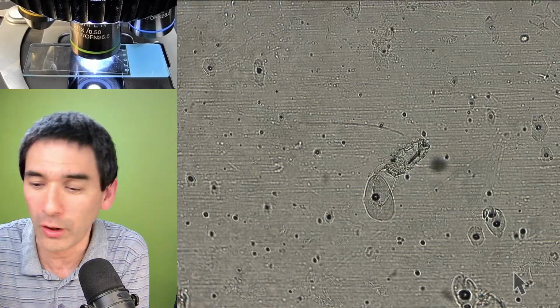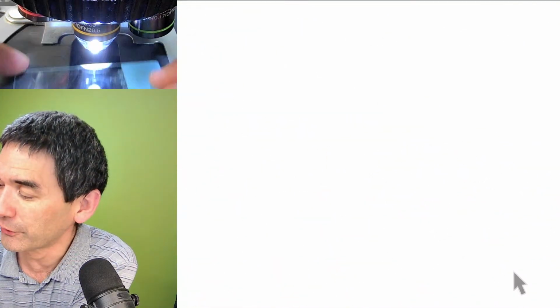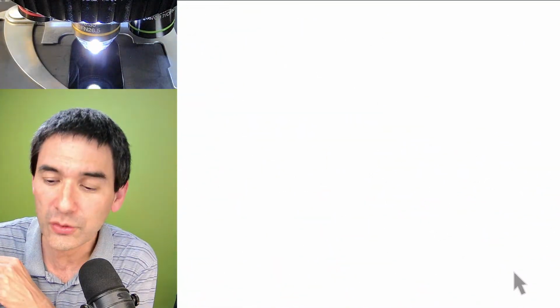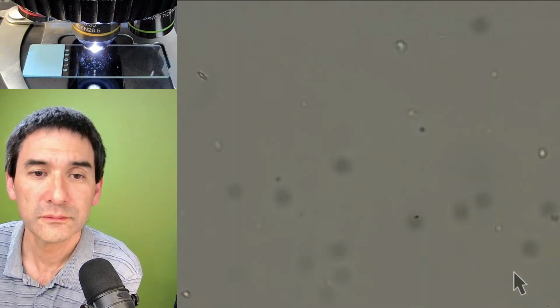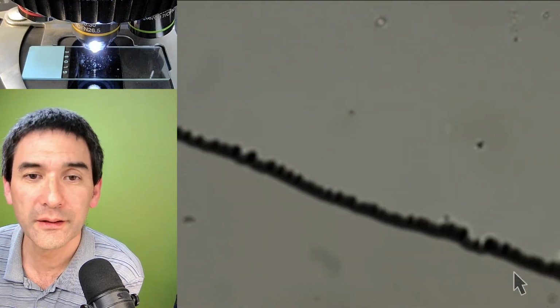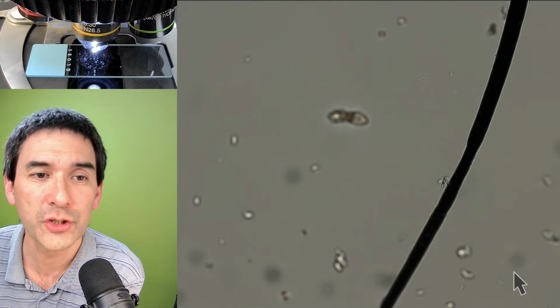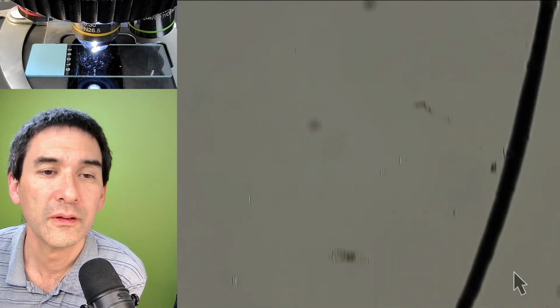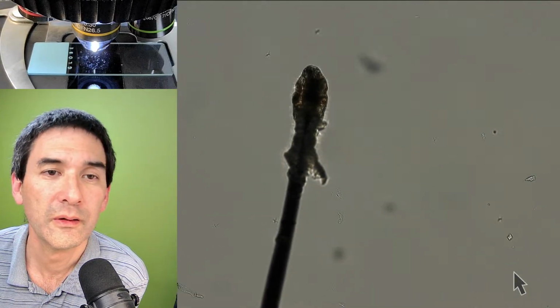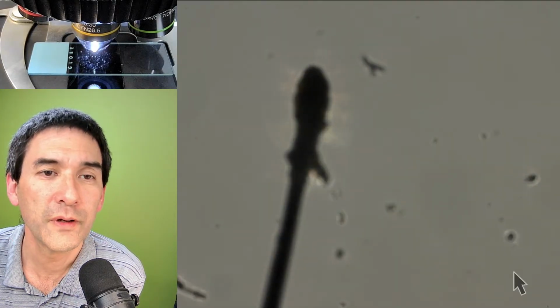Then I would pick them off, and when they're picked off, I would transfer them to a new slide, like the one that I have over here. And so that's my eyelash again. I have to find it again to focus.